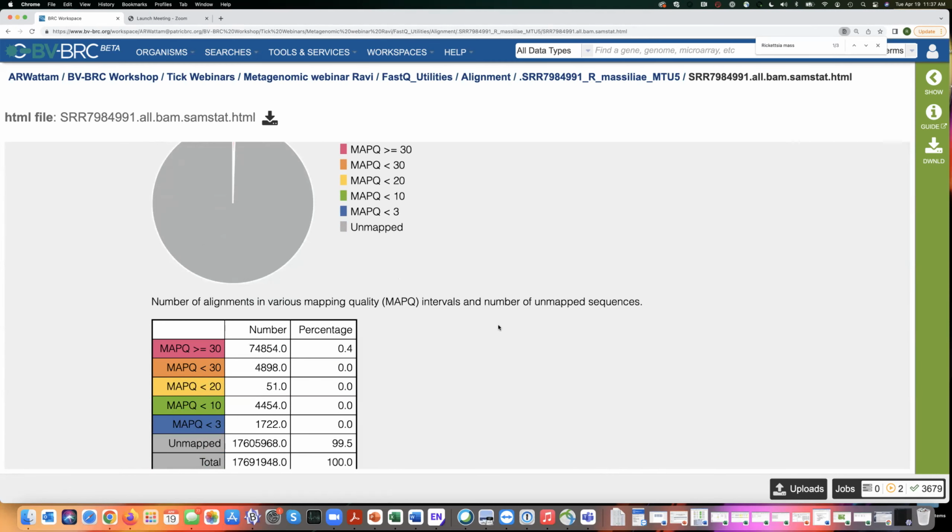Of course, other people would do it different ways, and probably I'm really just a biologist. I don't have any coding skills. And so this is the way I would do it. I'm sure a straight up bioinformatician would twist that data in a lot of different ways than I did, but I feel pretty confident that it was a misidentification.